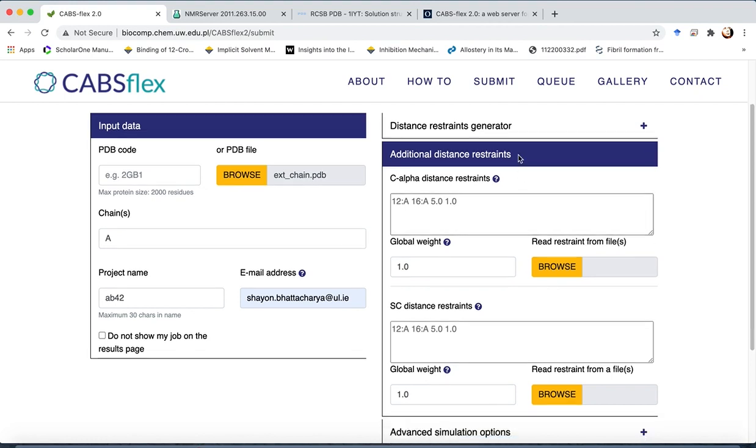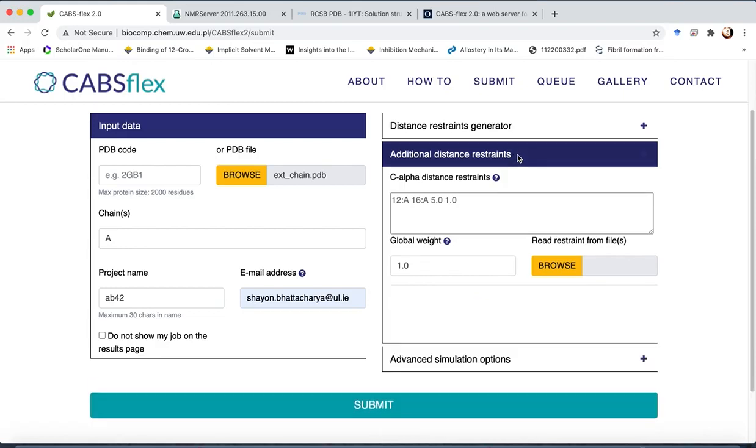All right. So we will not set any restraint for the simulation. That is, we will not put a bias on it. This will be an unbiased, free de novo simulation here. So we'll not set any values for this.